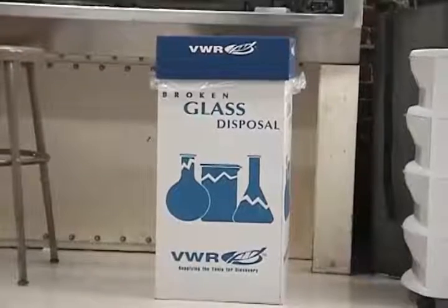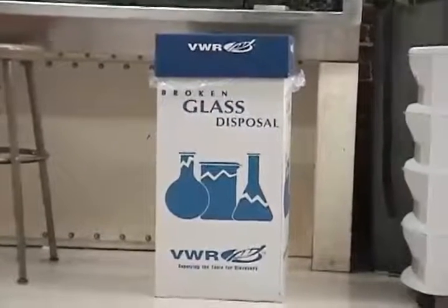Broken glass trash. Broken glass is only disposed of in the broken glass trash receptacles, which are these large corrugated cardboard boxes.